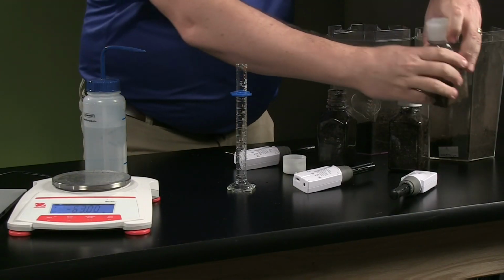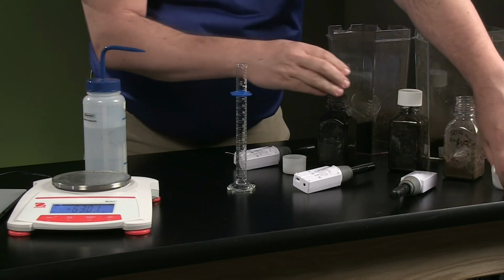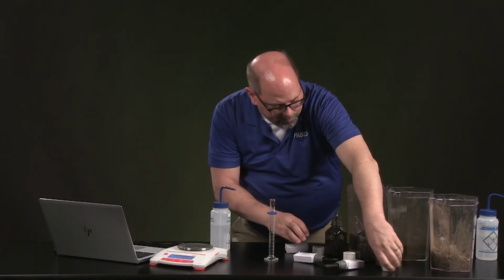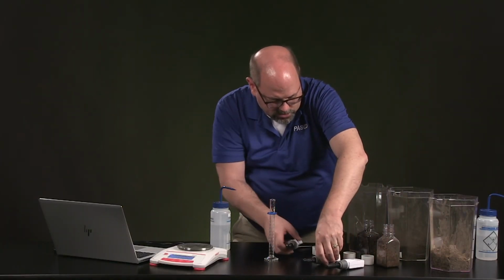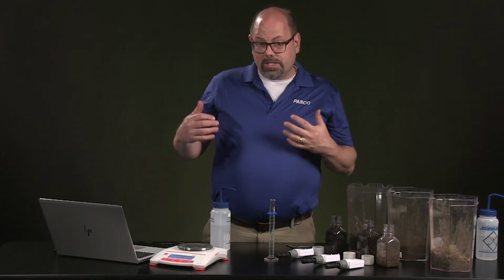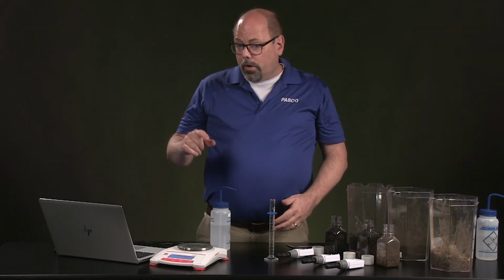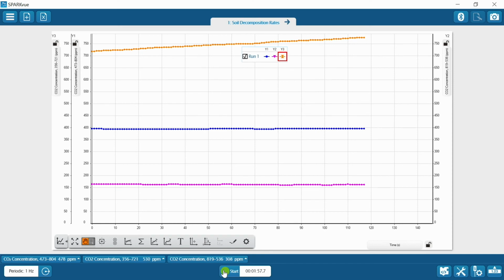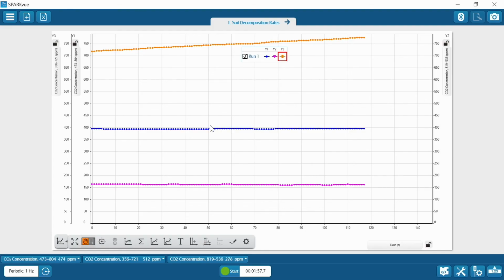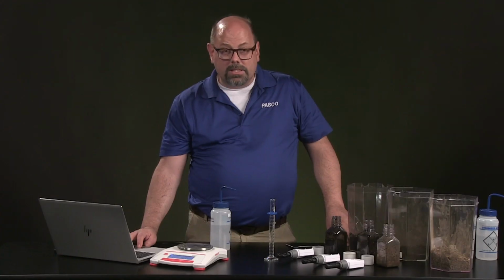Okay, so we get some water on there, and I'm going to go ahead and take the tops off. Again, I don't want to accumulate CO2. I want to see the rate. So take the tops off, put those here, and we'll keep our CO2 sensors right next to which one they started with. Now, what I want to do is to take a look, because we're still collecting data on the data itself. We're interested in what biological activity is going on in each of these kinds of soils. Now, Y1, that's this prairie grasses soil, is this blue line. And if I want to see what's the rate of CO2 production, I'm going to click once on the tool down at the bottom where there's a hand and make sure that the orange or the highlighted tool becomes the selection tool.